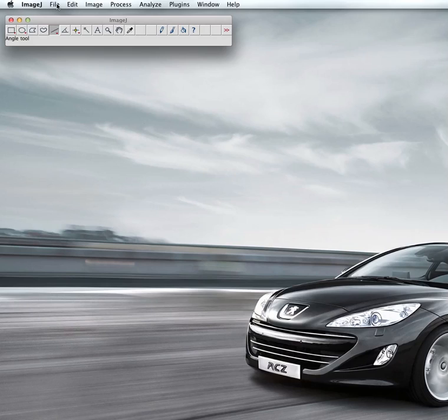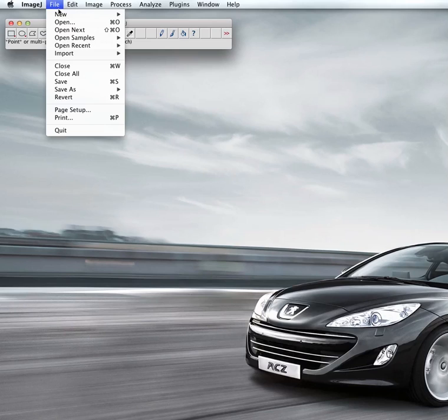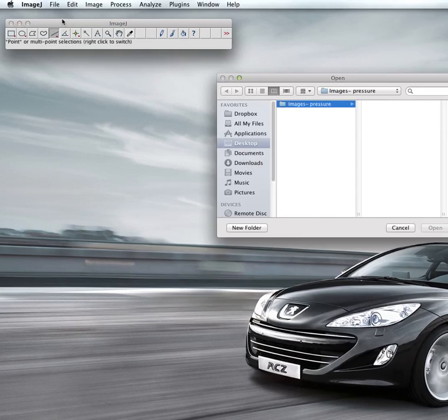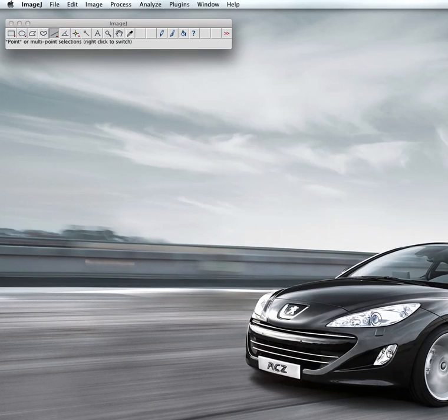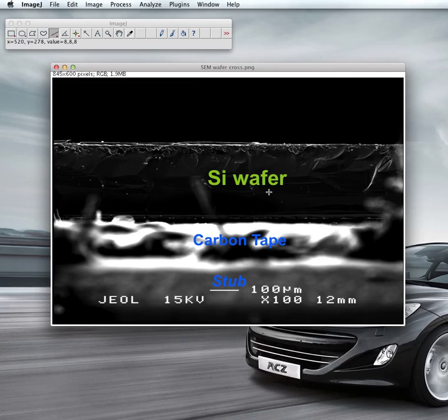First of all, I would like to open a file. Go to File, then Open, and click on the file that I wanted. This is a cross-sectional view of an object that I wanted to measure, where this image is imprinted with a scale.